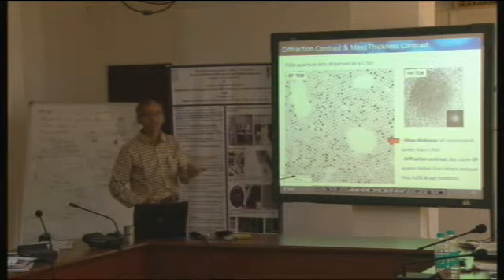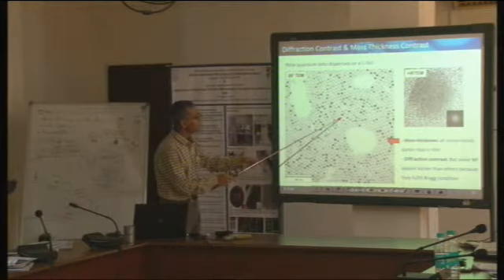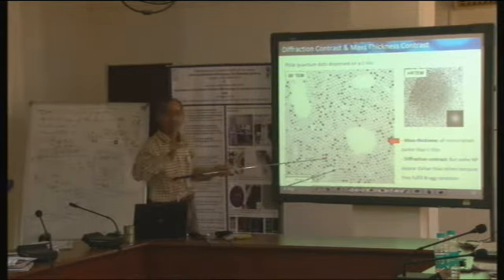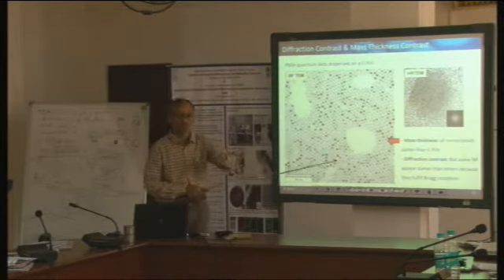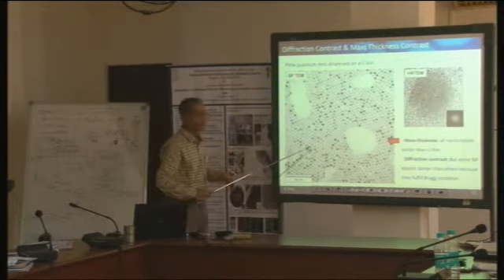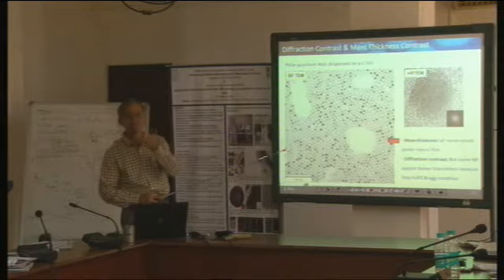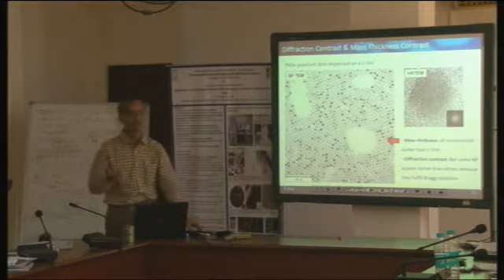This is directly a consequence of the fact that any region, even this one, which is probably looking the faintest, is still less bright than the region between the two particles where there was only carbon film. So it's directly a consequence of mass thickness. But among the quantum dots, some are looking darker than the others. That is because those which look dark are diffracting away more. That's the contribution or consequence of diffraction.